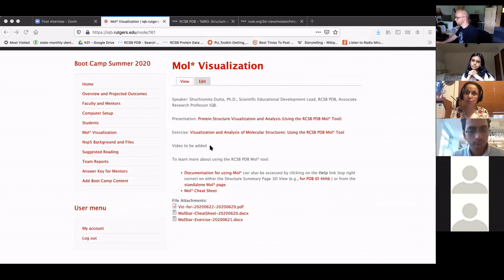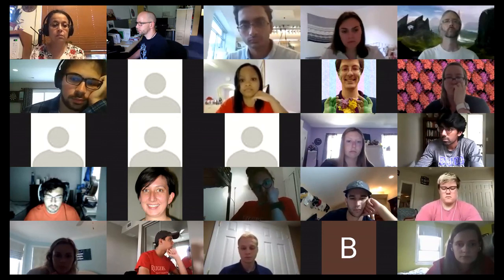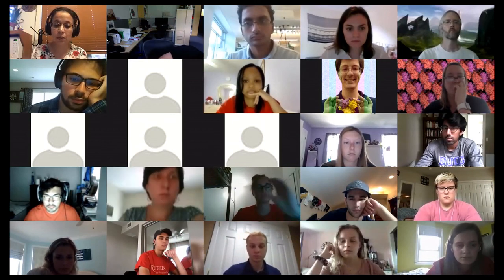If you want to label any particular domains that you need to recognize and so on, feel free to use a PowerPoint on your computer or any other graphics tool that you like to use for labeling. And let's get going. I am here on chat. I will stop sharing this and then we can take stock periodically, after 5-10 minutes, we'll see how far people have gone and if they're running into trouble.